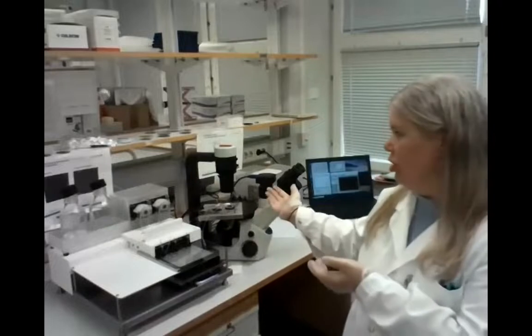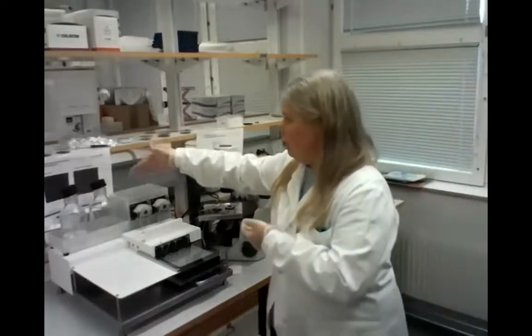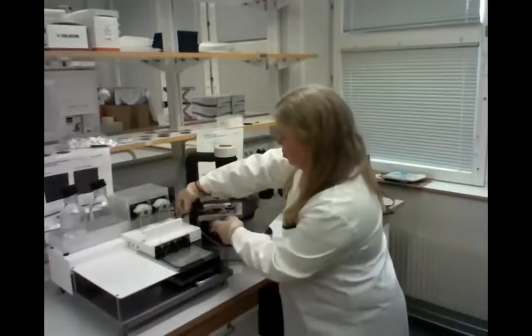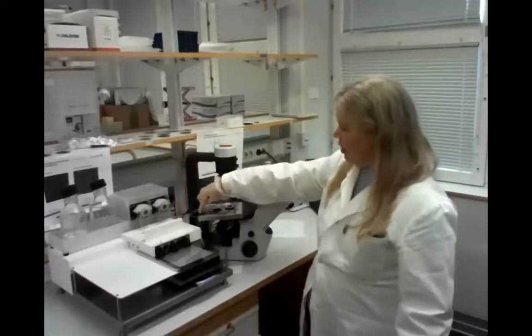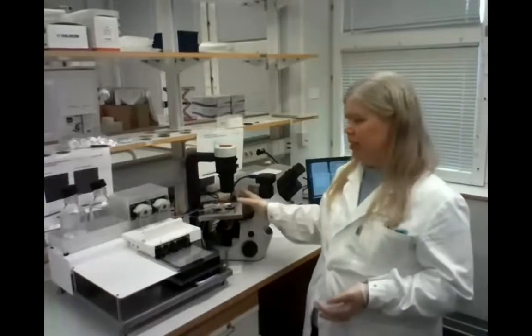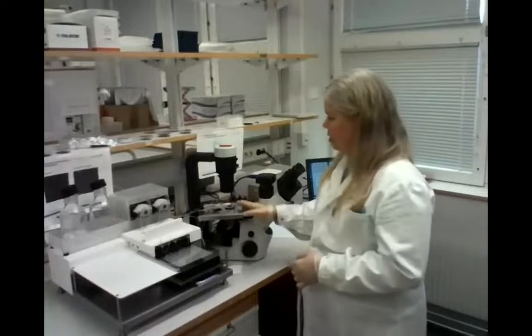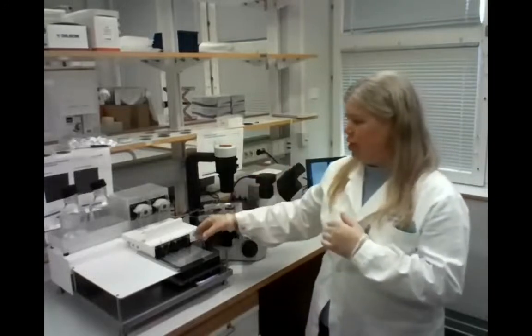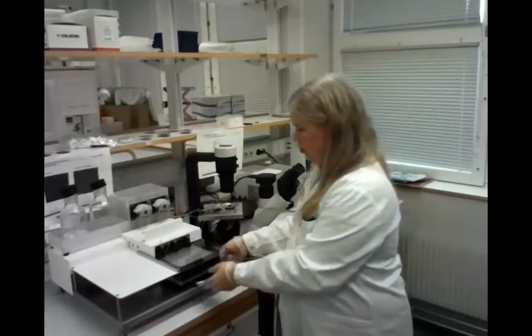So the experiment has started, and as I said before, you have those pumps pumping our blood simulant into the system, and that tube is actually within the system here, so the perfusate is then warmed up to 37 degrees. So everything is at body temperature. Then it comes, when it has passed through the dissolution chamber on top of the membrane, where the particles that have been dissolved into the mucus could be absorbed into the perfusate. The perfusate is further transported here to the fraction collector.